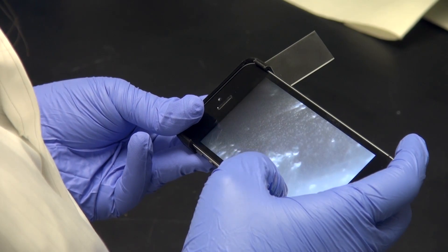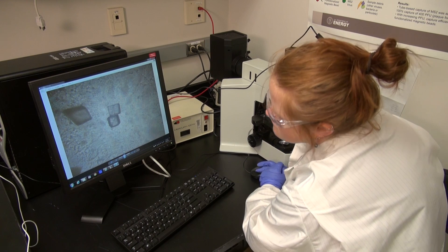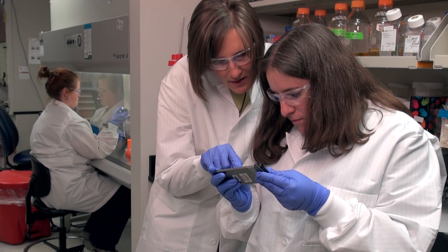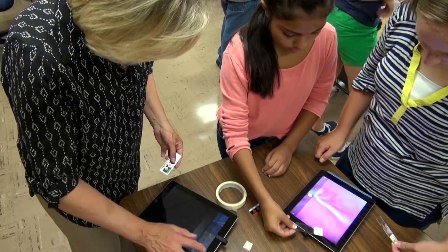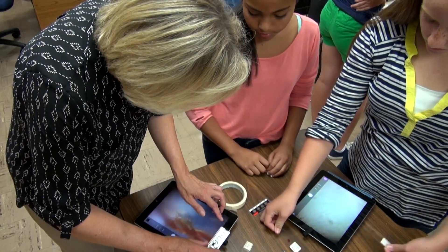And then the image could be sent to a trained microbiologist sitting in a lab across the country. It would allow decisions in the field to be made more quickly, and at the other end of the spectrum, be a great tool to inspire students' interest in science.